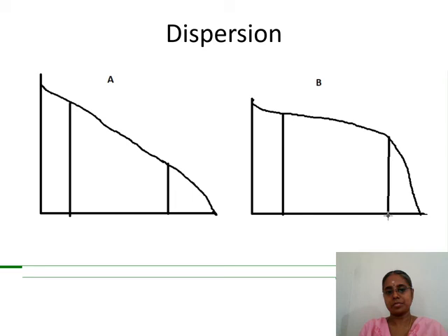which means that this is the lower quarter. We have our L, L dash. Here also we have L and L dash. Here is our M, M dash, and in this A we have M, M dash here.